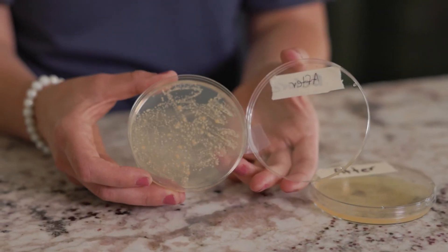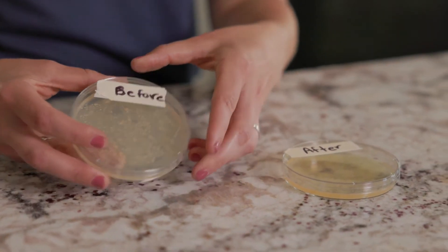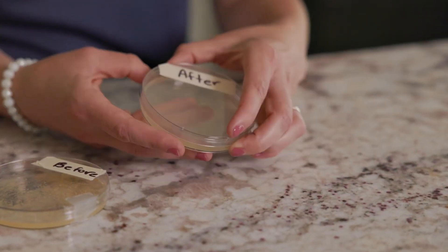Now, take a look at this. When I made these plates, I also took two samples from my kitchen counter, one before it was cleaned and one after it was cleaned.